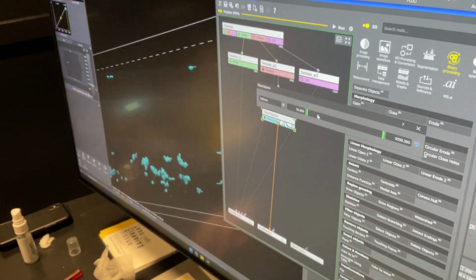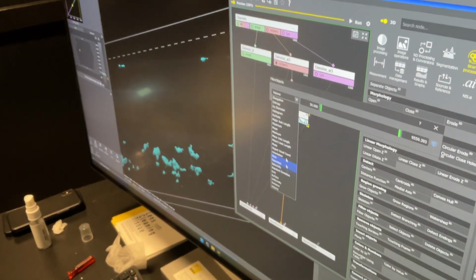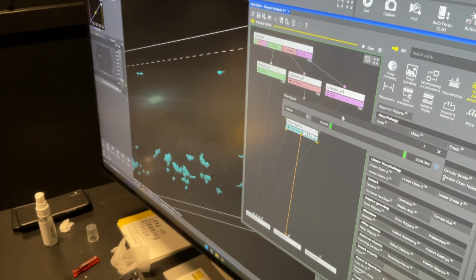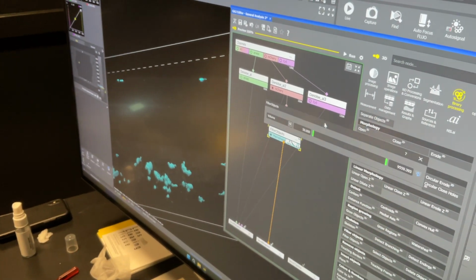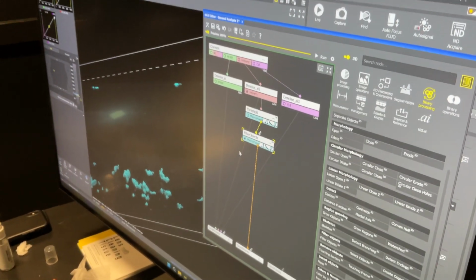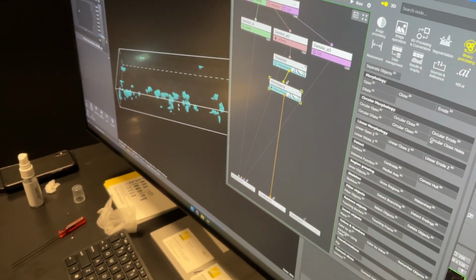But you can stack these too. So you could have a variety of different filters, and you can filter first by volume, then by shade, then by nearest neighbor. Like you can say, if they're two stuck together, they're not the same thing. So it makes it really easy. All right, so now we have a layer that we can start measuring on or through.